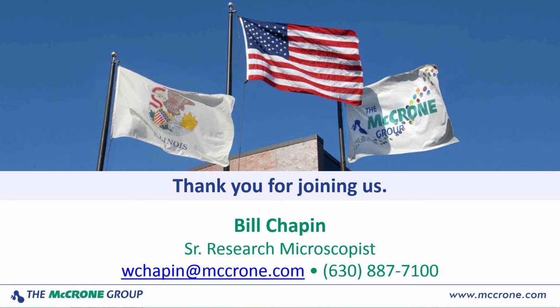One of the things you have to be careful of is if you're buying a more economical system, they may not be retrofittable. So you're just going to have to get back with your scope manufacturer and find out. And if they can do it, it's no big deal at all to do it.